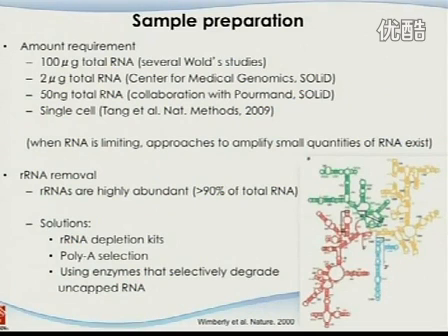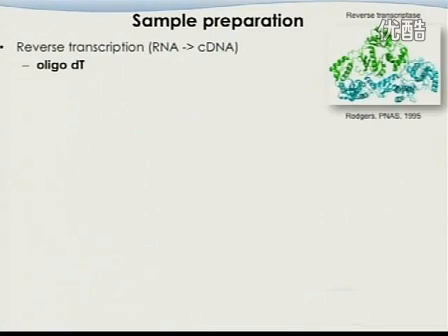So think of your experiment, you spend a lot of money on there. You think I sequenced really, really deep, I did have 50 million reads to cover the transcriptome. It ends up only 1 million or 2 million are usable. The rest are the ribosomes. It's a pretty bad thing to go through. But anyways, these are something that you really need to be very careful on.